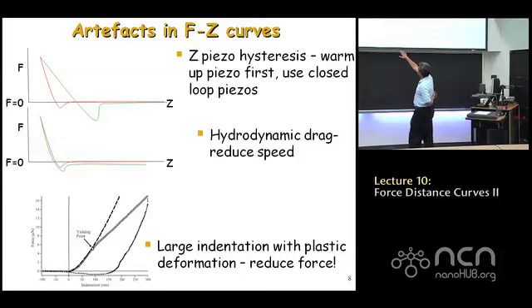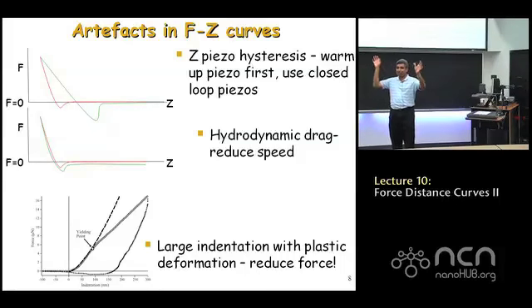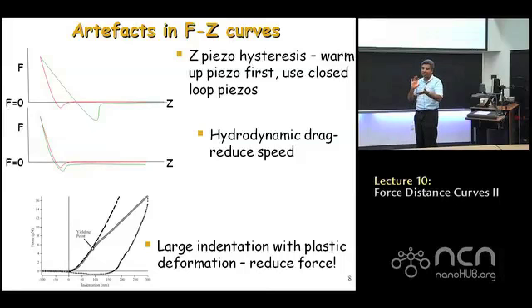So this is an example. As soon as you see this, you look at the force: micronewtons. As soon as you see someone plotting micronewtons, a red flag should go up, and you should say, oh my goodness, this is crazy. You're applying super huge forces. Things are deforming, breaking, all kinds of stuff. And in this case, it is intentional.